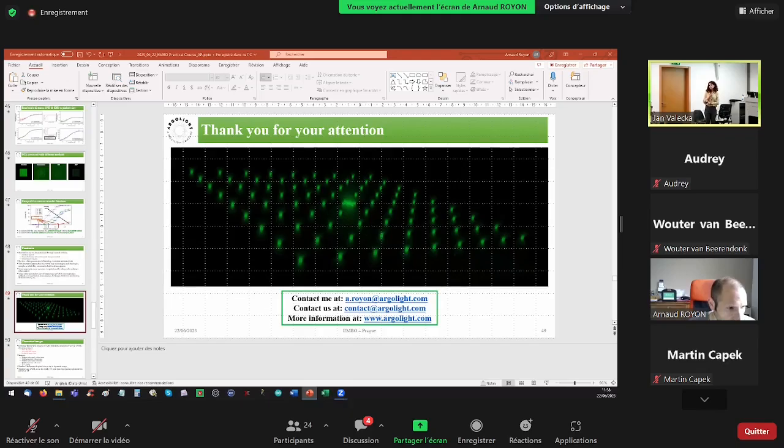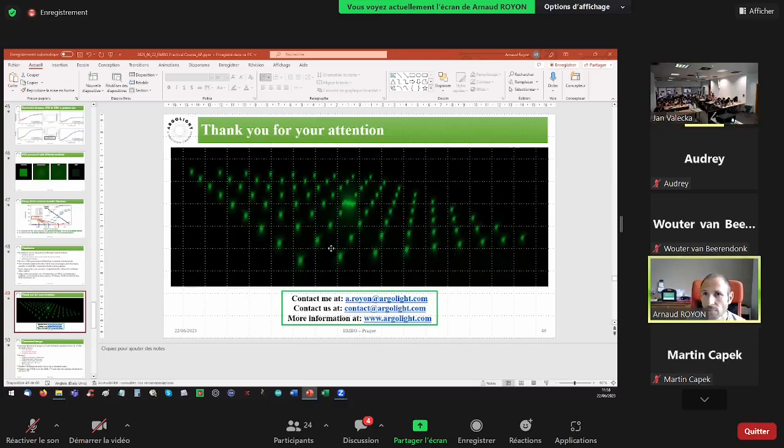Hi. Thank you for this really lovely talk. I was wondering, from several reports, I've heard that the line spacing profile actually often gave too good results. So SIM could resolve 90 nanometers and so forth, but that's actually too good to be true. Have you heard about this, or can you explain that?